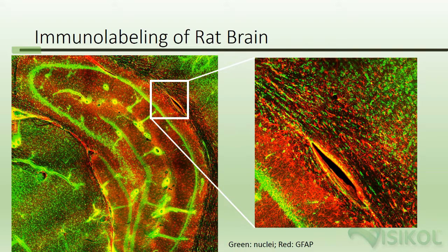Here is an example of results obtained from immunolabeling a rat brain. In this image, the green shows nuclei and the red shows cells labeled with GFAP. Here we see the rat brain hippocampus.